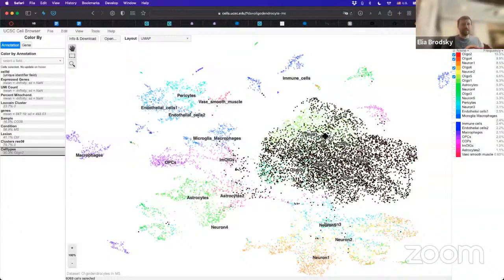Okay, so this is healthy tissue. Okay, so remember, this is an attempt to map out all of the different cell types, different bulk RNA-seq data, imaging data, and you will always see the differences in morphology and the different phenotypic part of that data as well. But then you want to go deeper and deeper and try to understand, well, what are the differences within this big collection of cells that we call neurons, right?